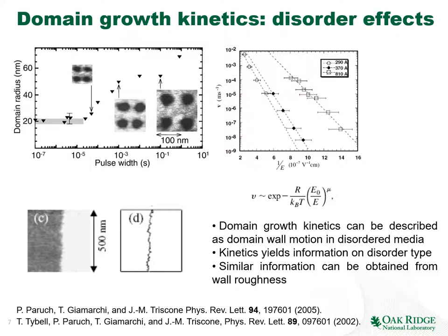It turns out that domain growth is strongly affected by the defects in the system, and Patricia Paruch's group in Geneva have done probably the most systematic studies of how the domain wall kinetics is affected by the disorder in the material. They directly correlated the effect of the disorder strength on the kinetics and the manifestation of the disorder in the roughness of the ferroelectric domain wall. These publications, which by now are classical, contain detailed information on this phenomenon.